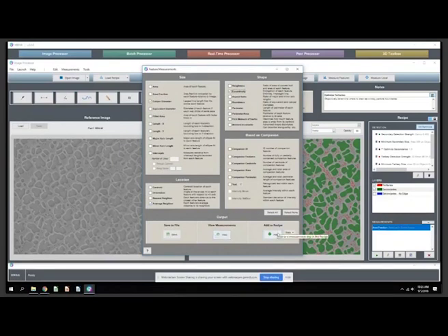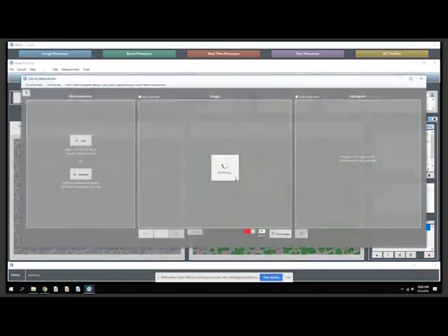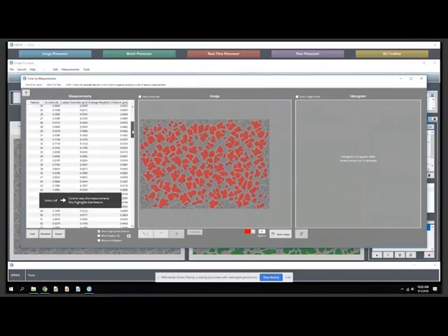You'll see me add these to the report in a second, but first I just want to visualize them, which is something that we and our users enjoy doing in MIPAR. Oftentimes a spreadsheet can't tell the whole story. This is great for some things, but you can often miss trends in your data. Even if you plotted this on a histogram, you don't see necessarily where these measurements came from in your image.